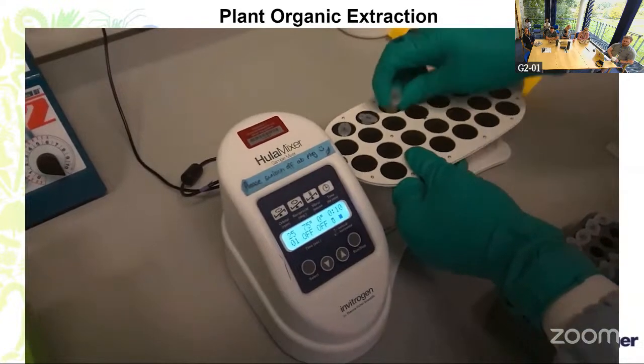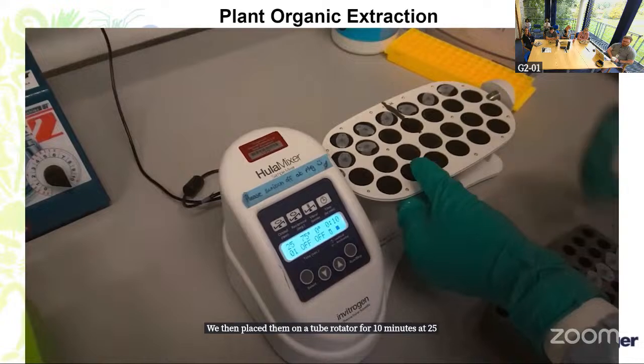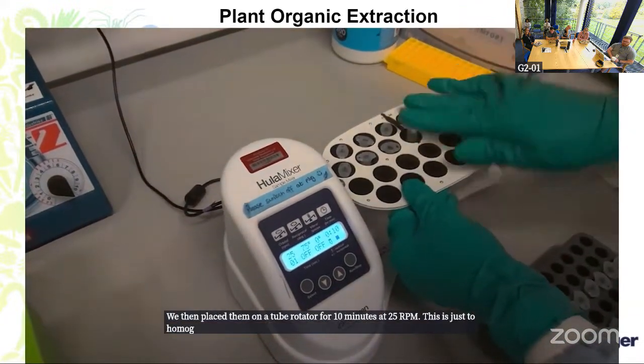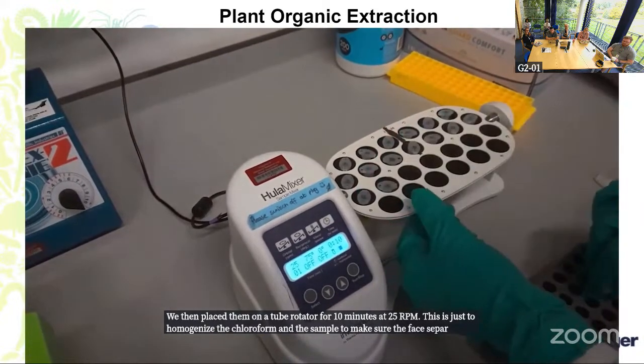We then place them on a tube rotator for 10 minutes at 25 RPM. This is just to homogenize the chloroform and the sample to make sure the phase separation works successfully.